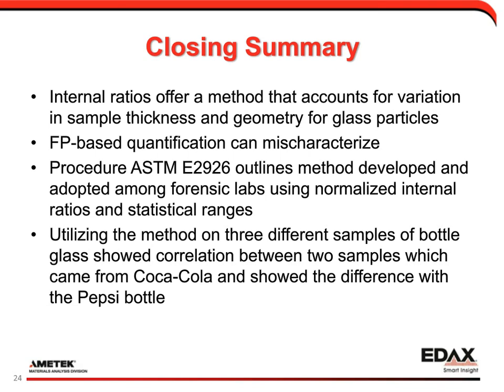The FP fundamental parameter-based quants obviously can mischaracterize these samples because they assume it comes from a bulk thickness sample and do not compensate for variation in thickness.